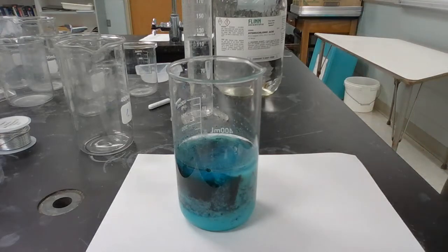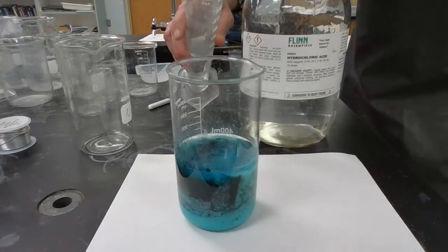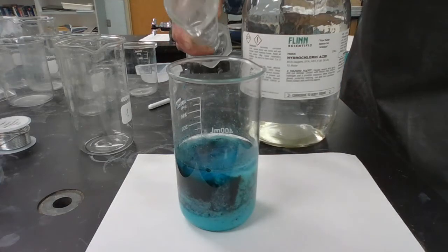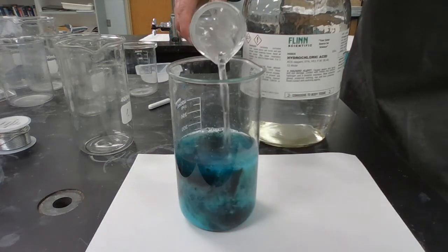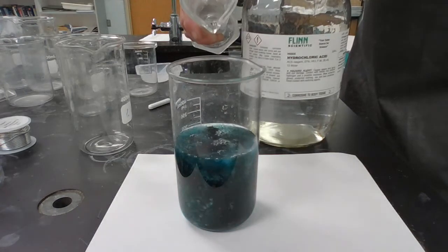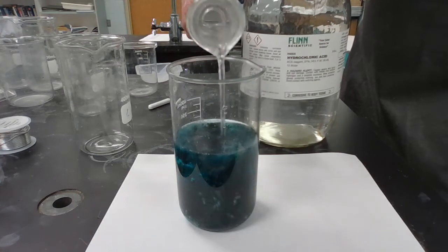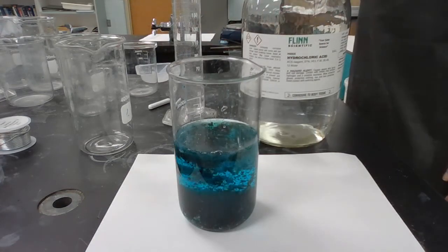Now what we're going to do is take our hydrochloric acid and pour it into there. So we're going to see by adding hydrochloric acid what will happen here. We'll mix it with our stirring rod.